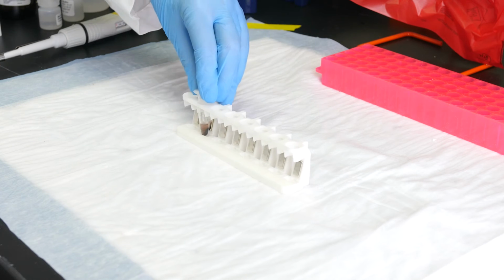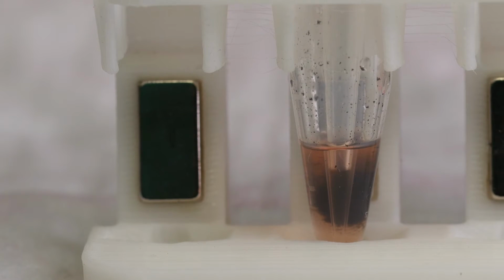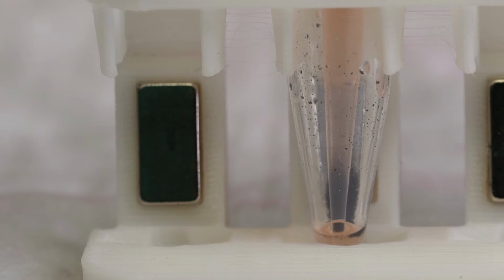Separate the beads and aspirate off the lysate. Each RNA strand binds multiple beads, which makes the separations much faster now. You'll notice the separation only takes a few seconds.